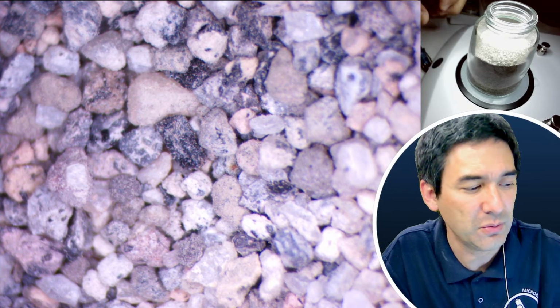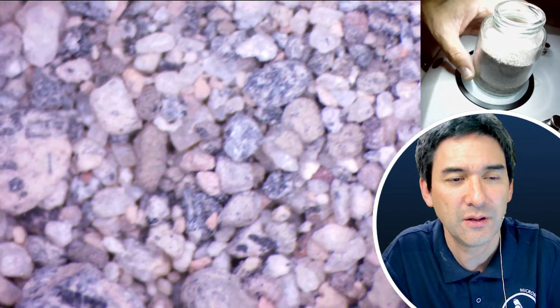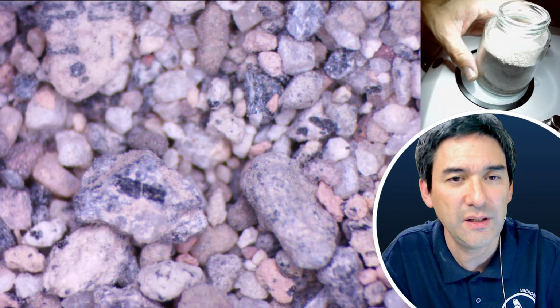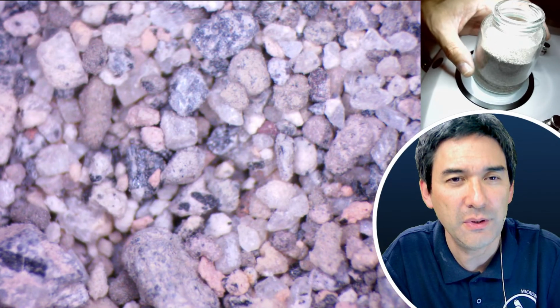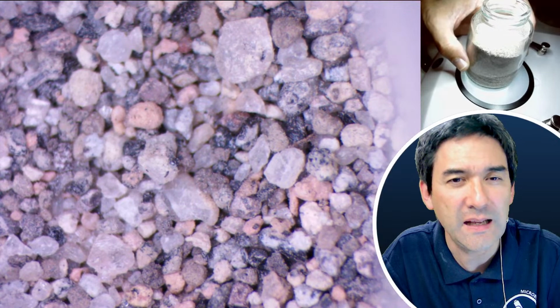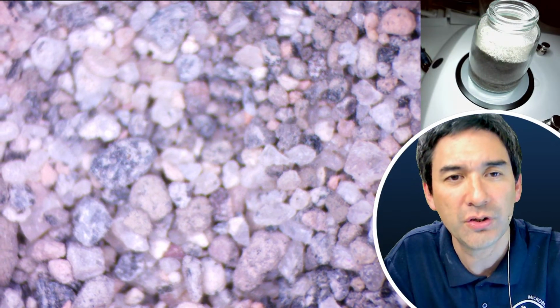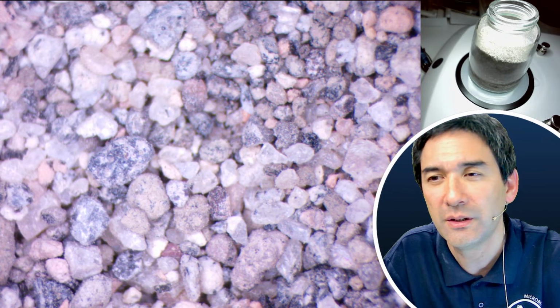You don't actually see that from the outside. So I think the sand here does need a little rinse. It can also be that there's a little bit of clay mixed in, and that's why it looks a little bit whitish.